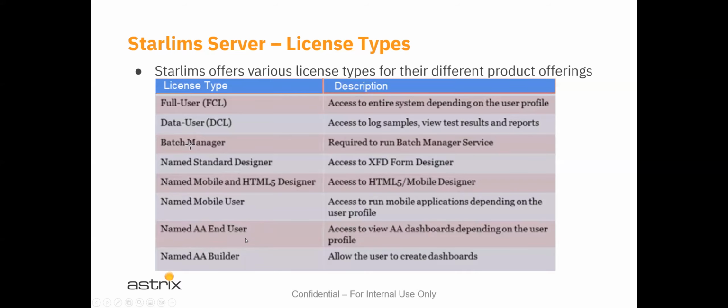For the advanced analytics designing system, there's a separate workstation that is used in order to design these visualizations and these bar graph type things that are displayed in the center dashboard of the STARLIMS system. Because STARLIMS actually has a professional services department that generates this type of work, and they do this type of design work, they actually want to be able to control how that works, right? So either you buy an advanced analytics builder license so that you can do it yourself, or you contract their professional services team to do it for you.